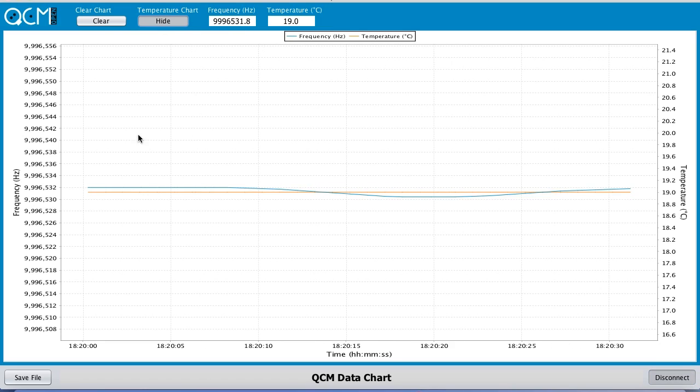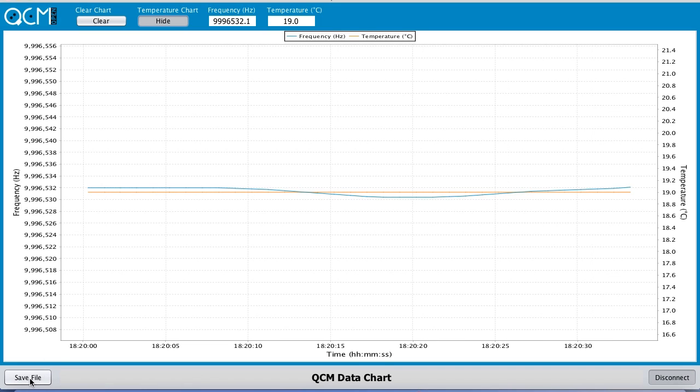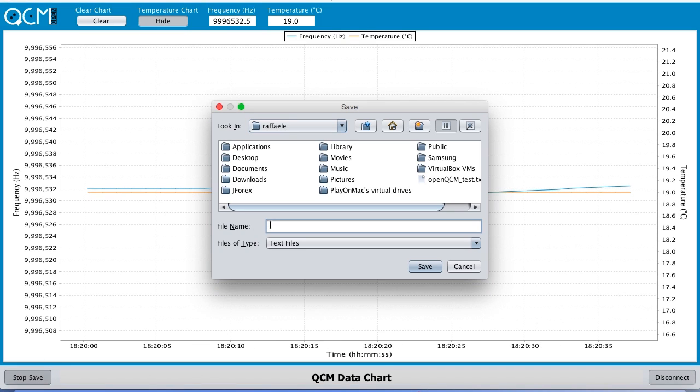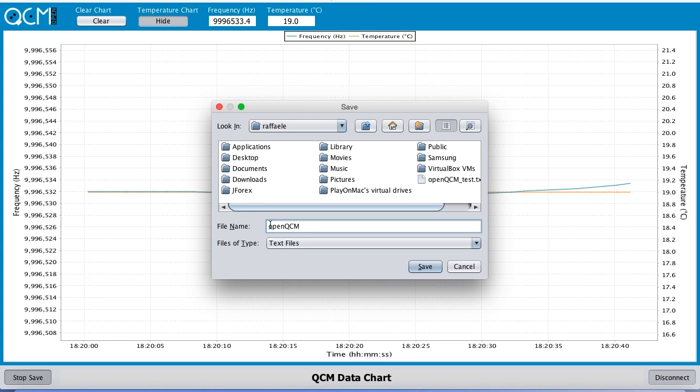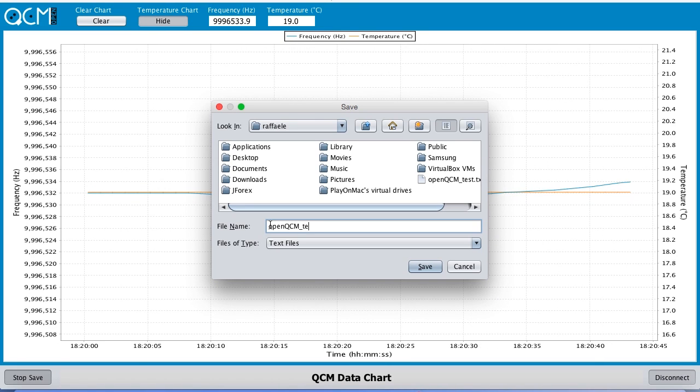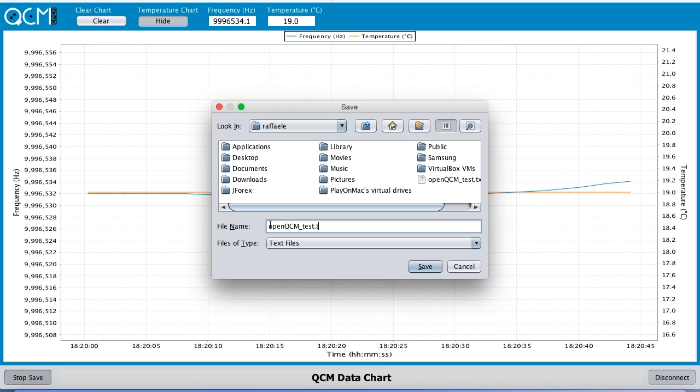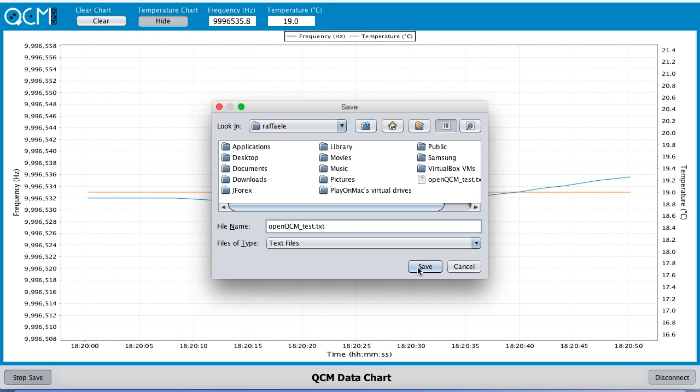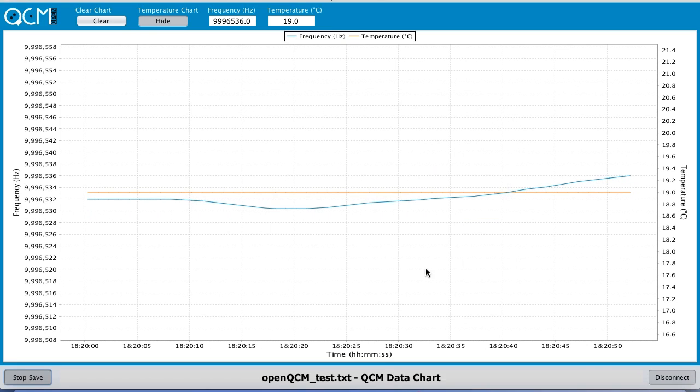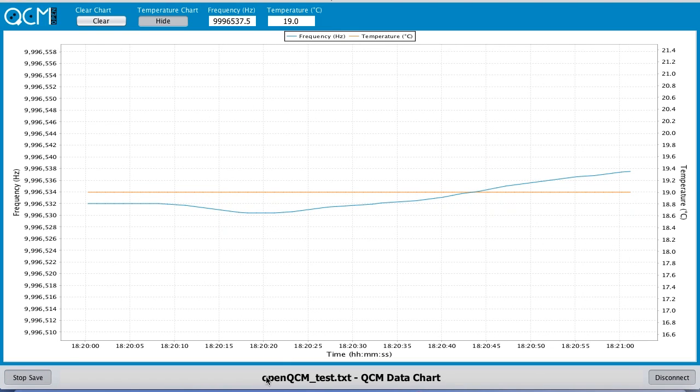Press the save file button. A pop-up will be displayed. You can save a new file or choose an existing one. The new data will be appended to the existing data. Press save to log the new data.